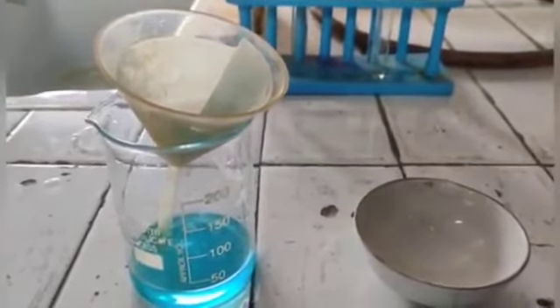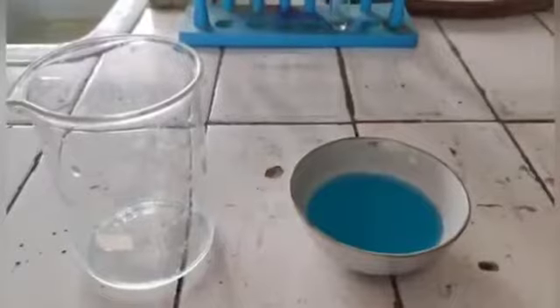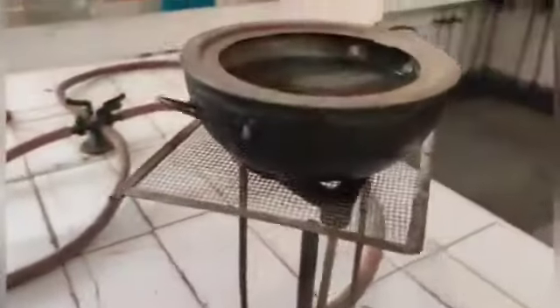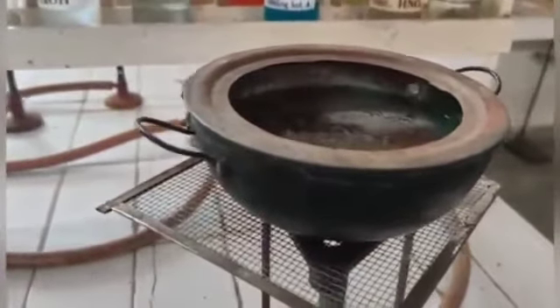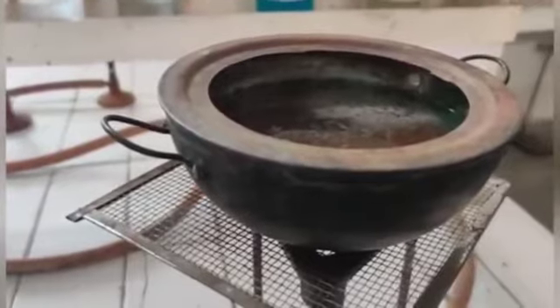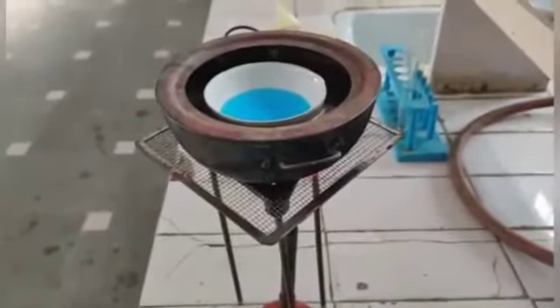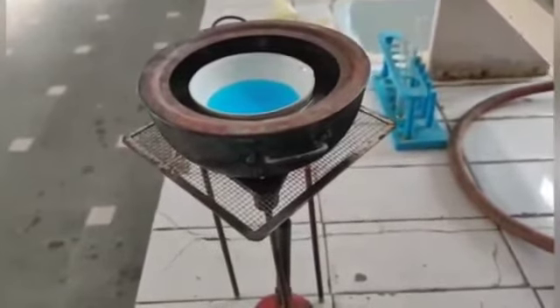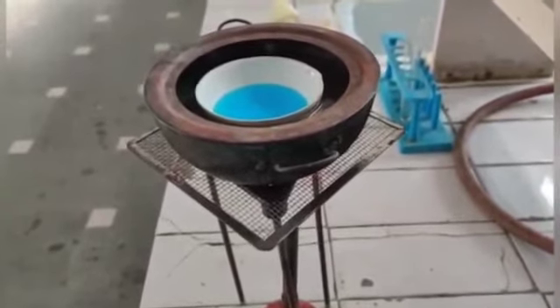Now we will transfer this filtrate into a china dish. After that we have to put it in a hot boiling water bath — we will not directly heat the saturated solution, we have to introduce it into a water bath. We will heat this china dish until the solution is reduced to one third of its original volume.